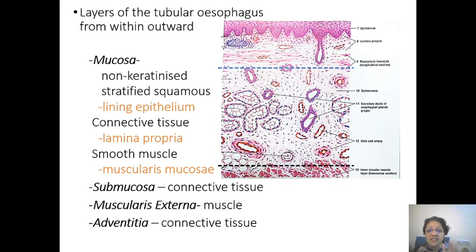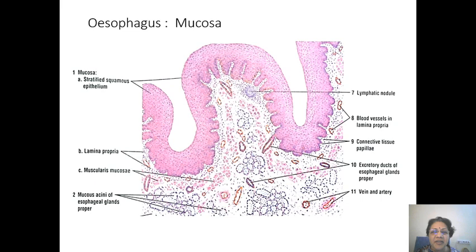So the inner circular muscle is always inner circular muscle. Don't label it any other way. You need not call it TS or LS, it doesn't matter. But always label it inner circular muscle, no matter which section it looks like under the microscope.